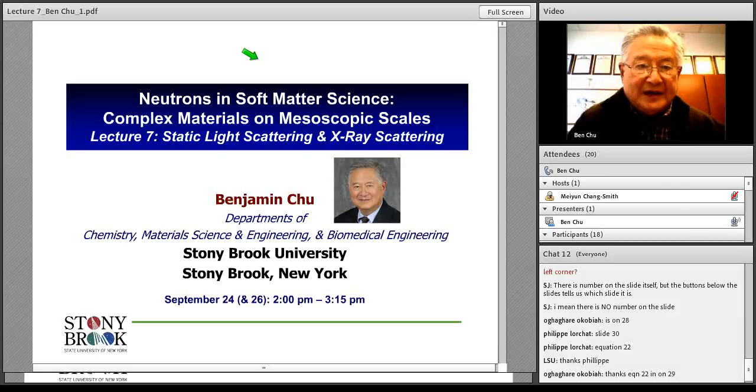If that's so, then I can measure the excess scattered intensity, which is the I of the solution minus I of the solvent. Therefore, the excess scattered intensity is related to the scattered intensity of the solute. It means the properties of the solute can be obtained simply by subtracting the contribution coming from the solvent, and that is only true for dilute solution. For infinitely dilute solution, we can also neglect the interference between light from different particles.